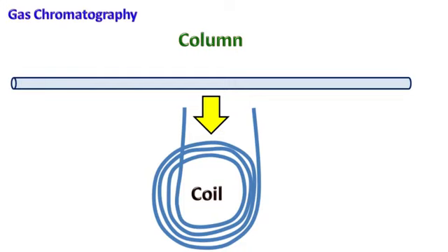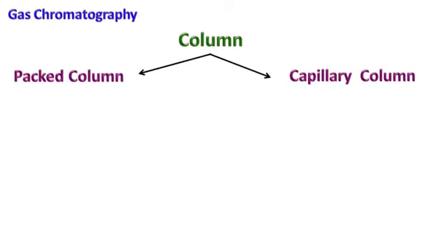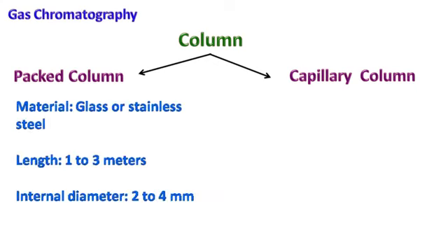The column. The column used in gas chromatography is very long and arranged in a coil. The columns used in gas chromatography are of two types: number 1, packed column, and number 2, capillary column. Packed column. A packed column can be made of glass or stainless steel. The length of this column can vary from 1 to 3 meters and it has an internal diameter of 2 to 4 millimeters.